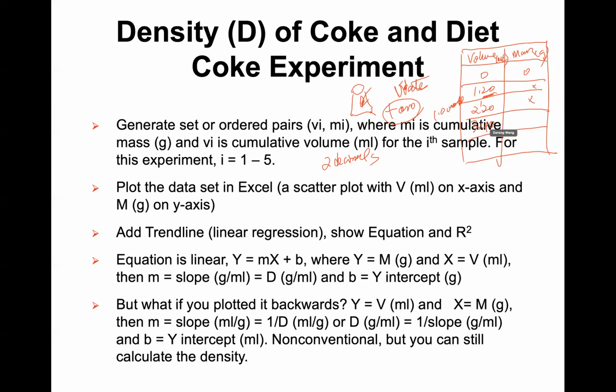And so then you have another mass. Then this one here, we added, say, 4.56. Then you have that. Then in this case, we get 6.53 or 51. Then this one. So you have those numbers.